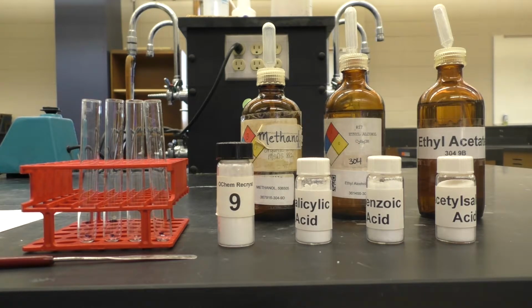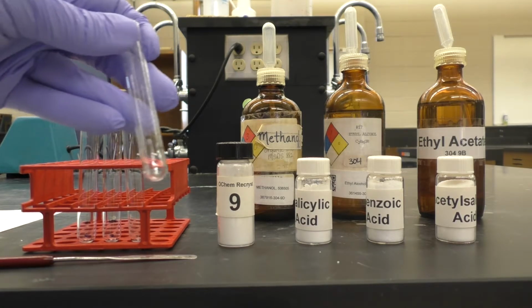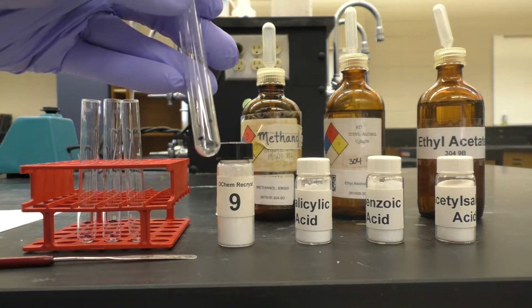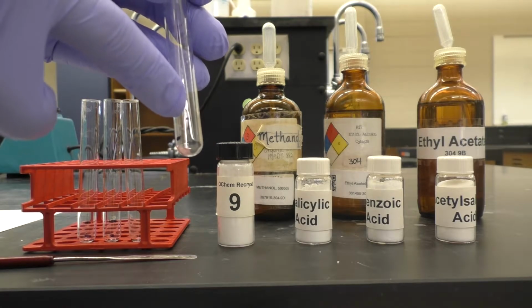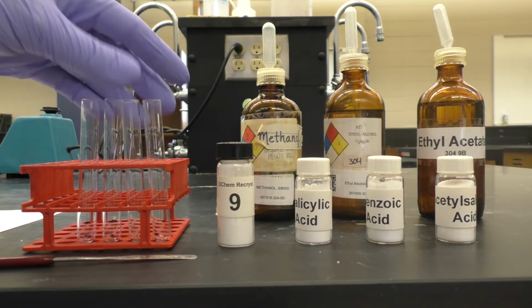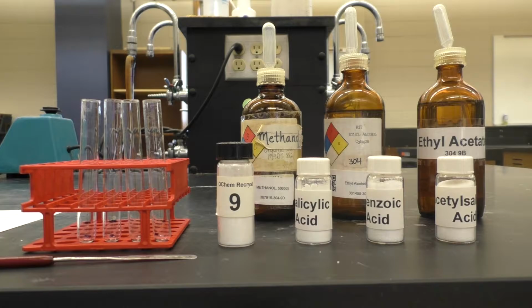So what I'm going to do is measure out approximately the same amount of solid into each of the 4 test tubes, and then I'll add approximately the same amount of solvent, one of each of these different solvents and also water, to the test tube. In order to keep things relatively uniform, I've made a small mark on the test tube to indicate how much solid I should add, and then another mark up above to indicate where I should bring the level of the liquid. I've done that on all 4 so that we have approximately the same amount. So I'll begin with that, and then we'll test their solubilities and compare.